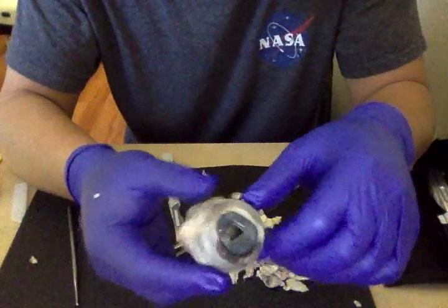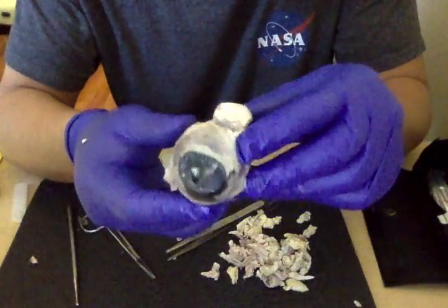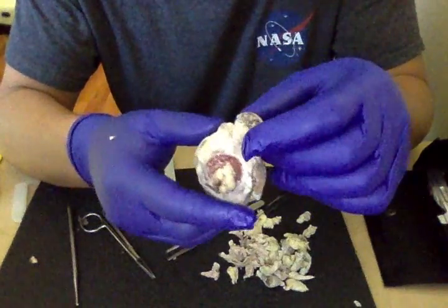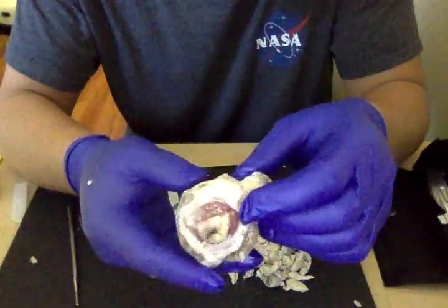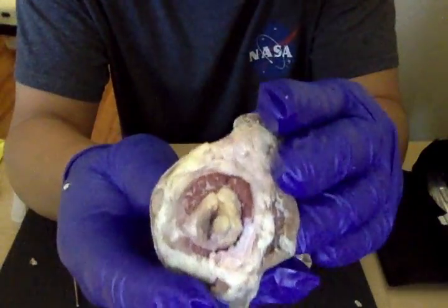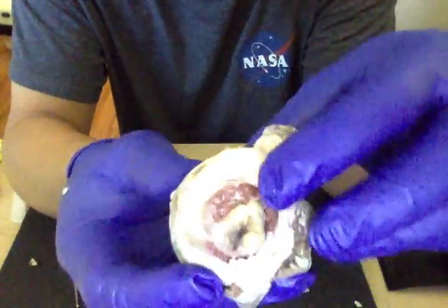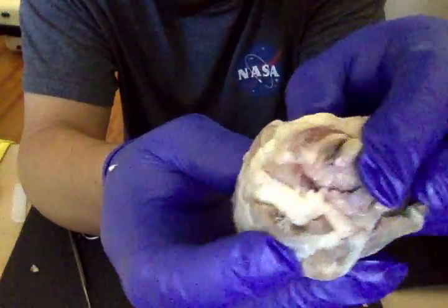That's the anterior. I already poked a hole in the cornea. That's the posterior of the cow, and this is the anterior and this is the posterior. There is still some fatty stuff around the posterior, but that is the optic nerve as you can see.